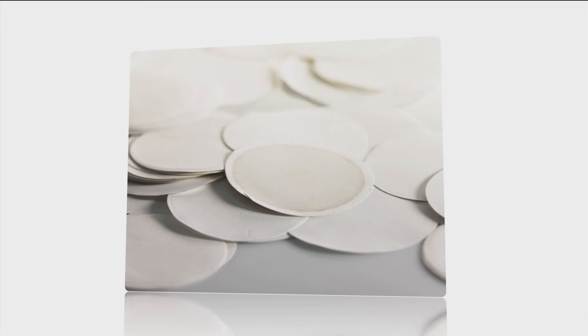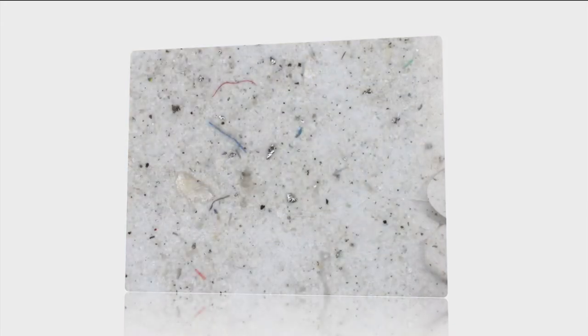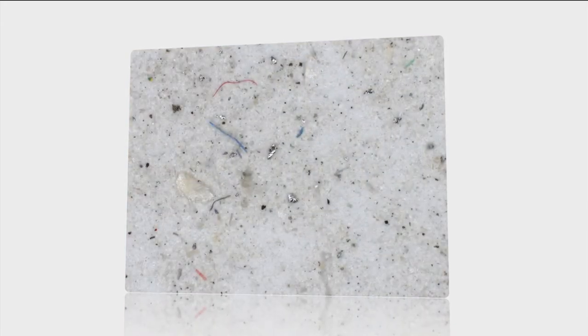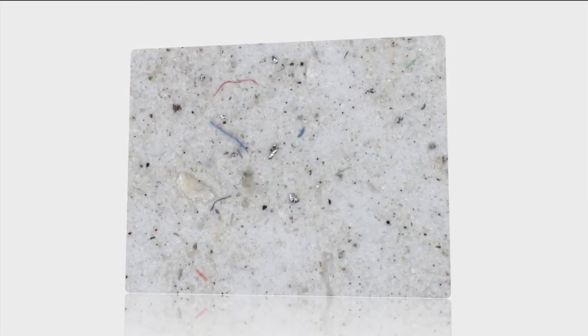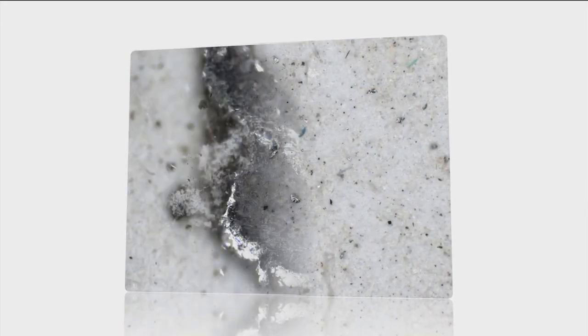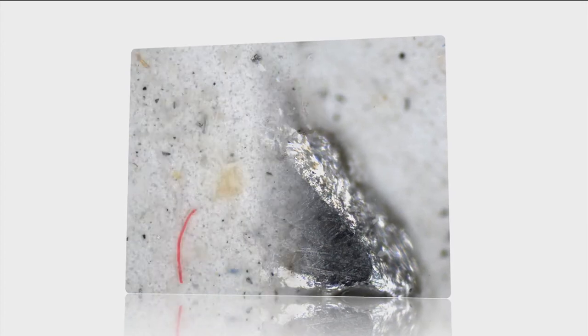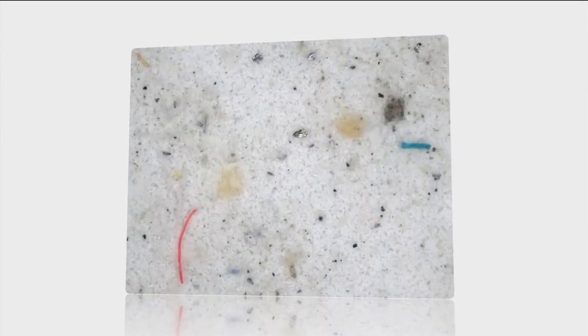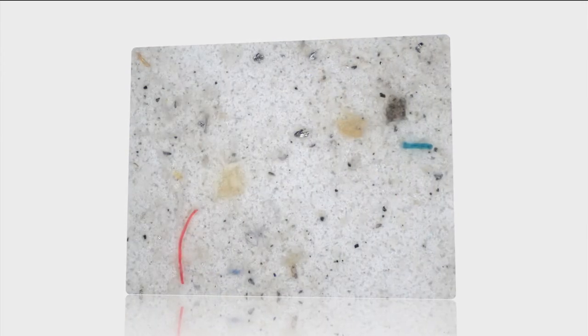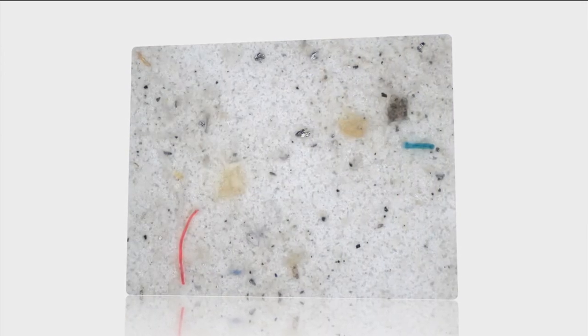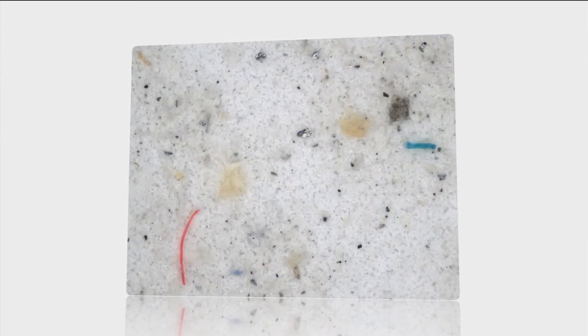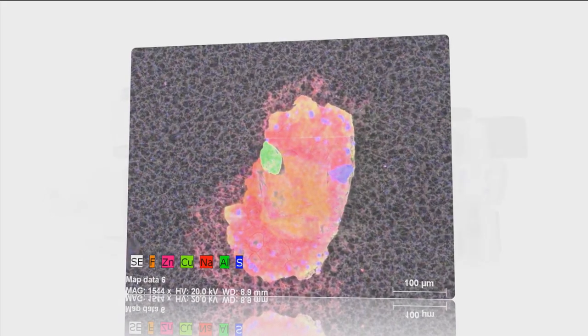Do you need to analyze particles caught on your filters? Do you also need comprehensive information on metallic, non-metallic, inorganic and organic particles? And do you need to know the types and material classes of process critical particles?